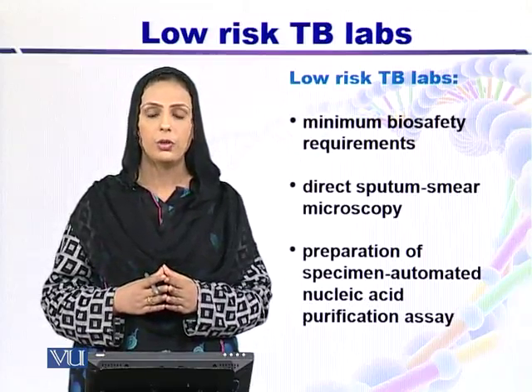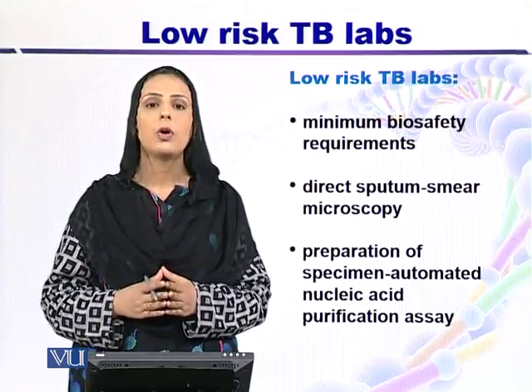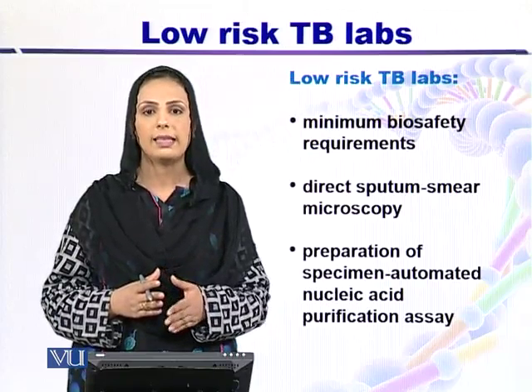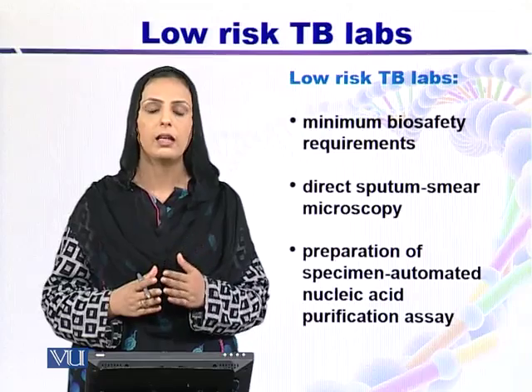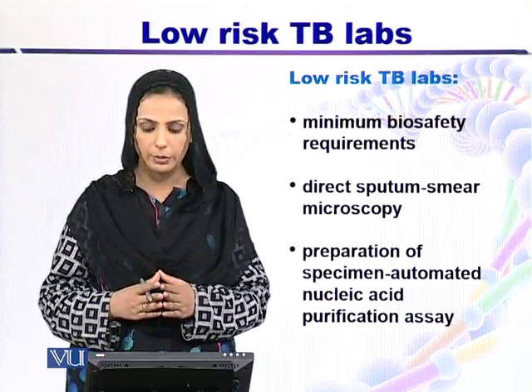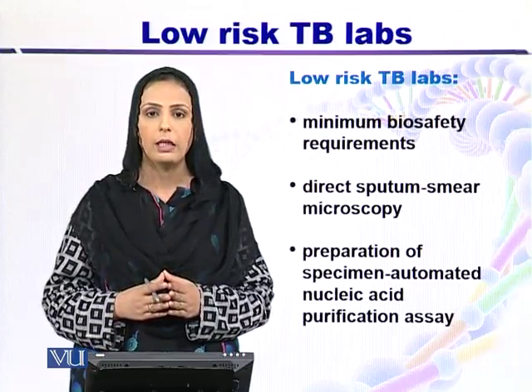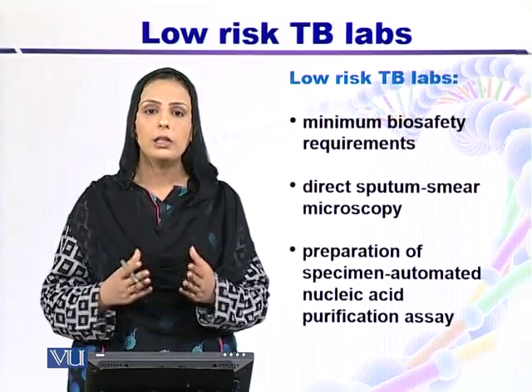Now, during preparation of smear, there are fewer chances of aerosol generation because sputum is a little bit viscous, and there are fewer chances of aerosols affecting the workers or contaminating the environment. So there are very few chances of contamination of the personnel or of the environment through smear preparation from direct sputum. Whenever we are preparing a smear, we say that there are minimal chances of the formation of aerosol. We don't say that there are zero chances, because once we prepare the smear, we allow it to air dry.